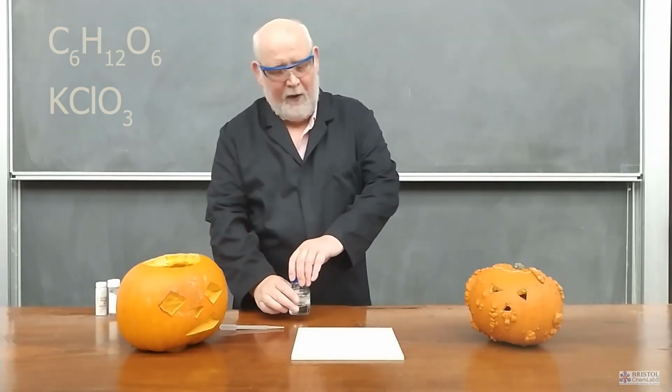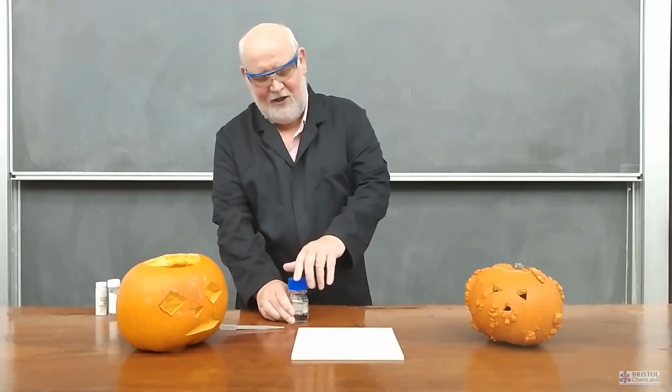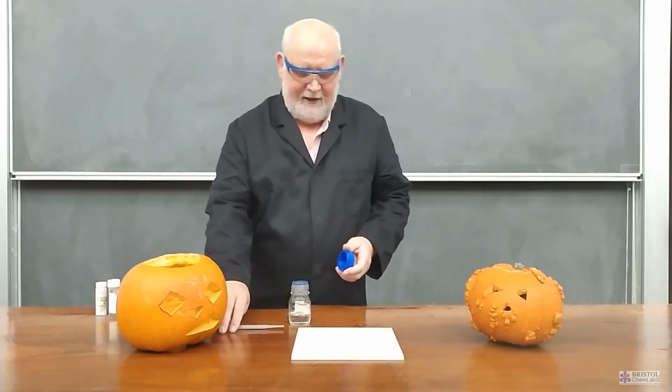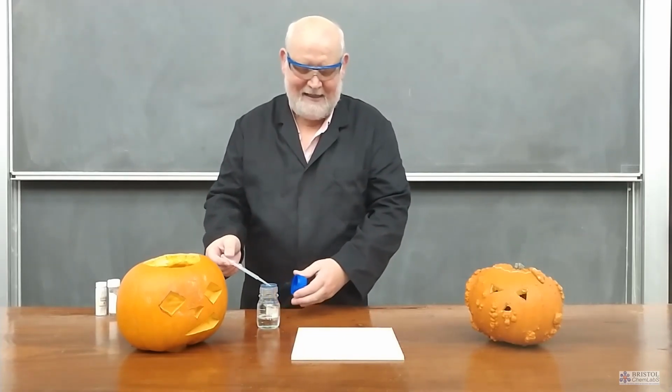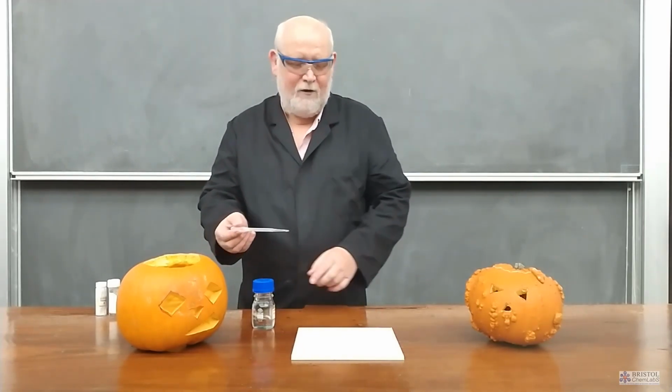To get this going, to provide the activation energy, I need to set up a side reaction using concentrated sulfuric acid as our catalyst. So I'm just going to add a few drops of this.